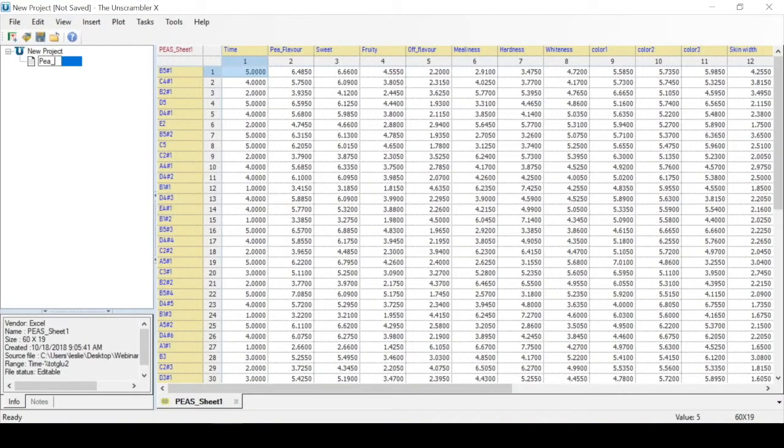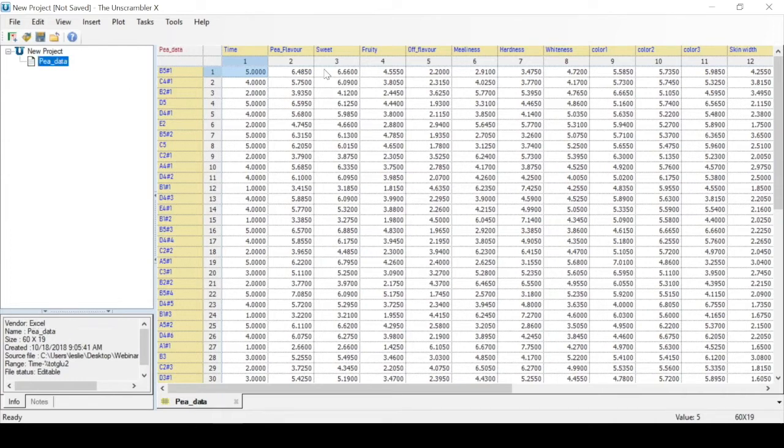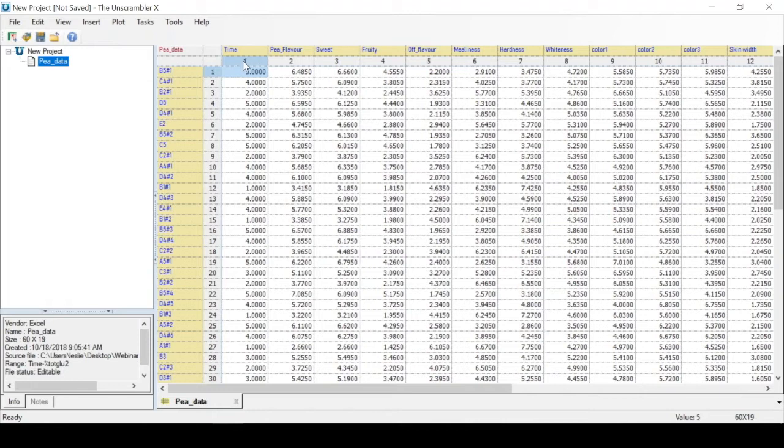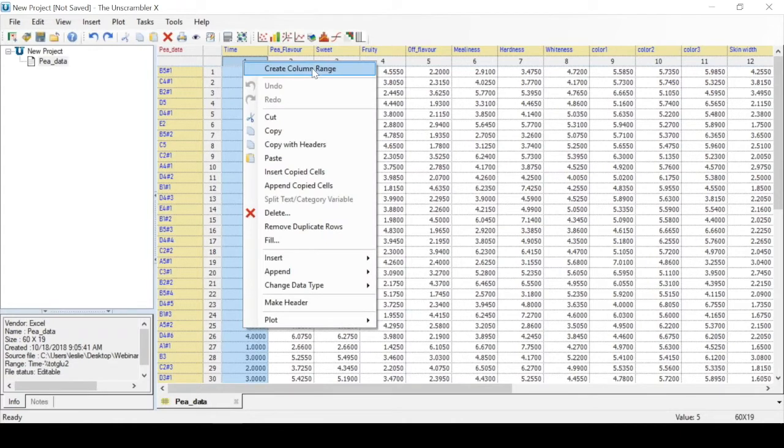Here we're going to start with a data set that we will call pData. Within the data, you can make row sets and column sets. So for example, if you want to make a column set for time, just click on the column number, right click and select create column range.